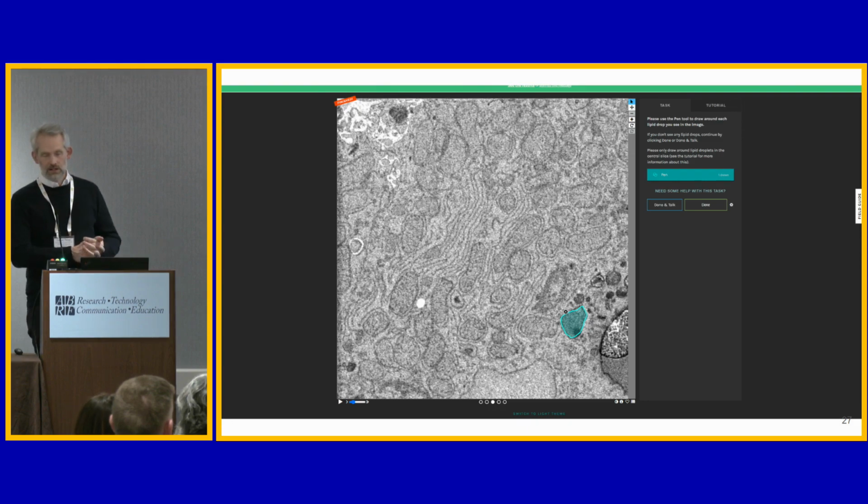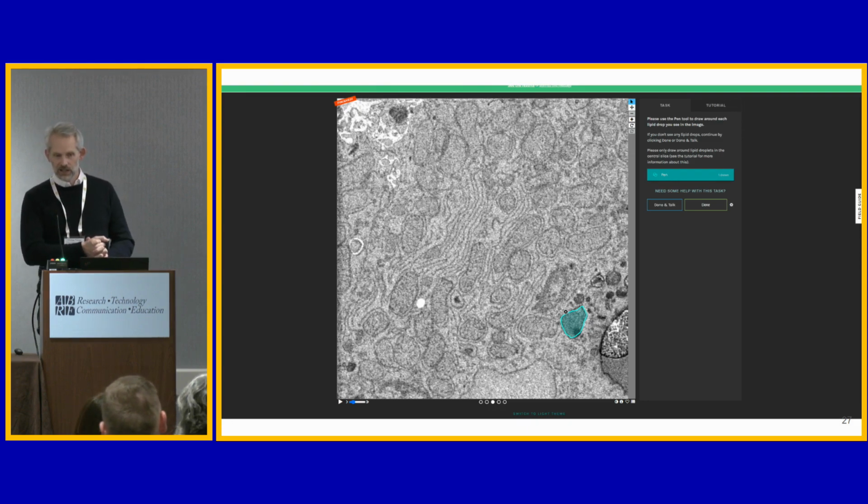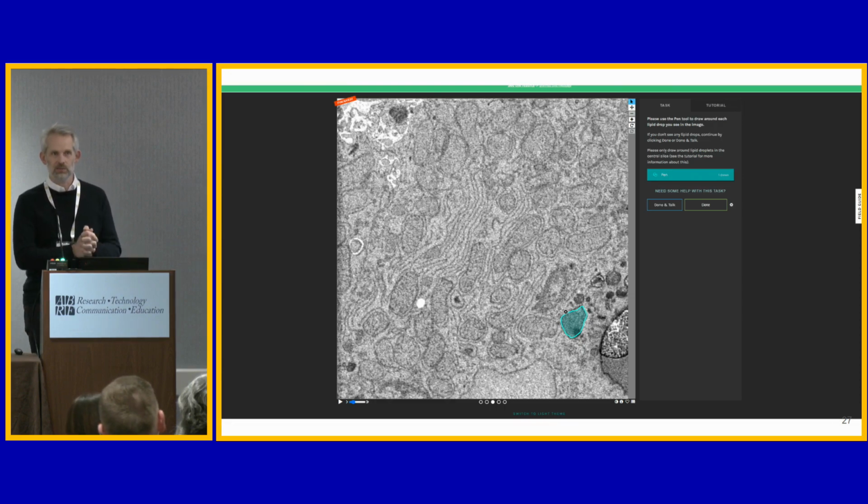It works surprisingly well. What's surprising about this? The surprising fact is that when you take 15 masks from 15 different people, the average mask you get is actually quite accurate. That's what we've seen, and that's what we've been using for this. The step of combining those 15 masks can be done in many different ways, but even simple ideas work well. So I think, yeah, this is the last slide. We're open for questions, and thank you.